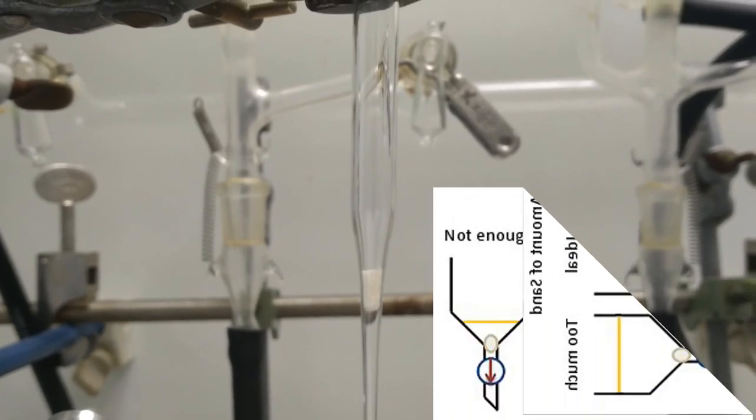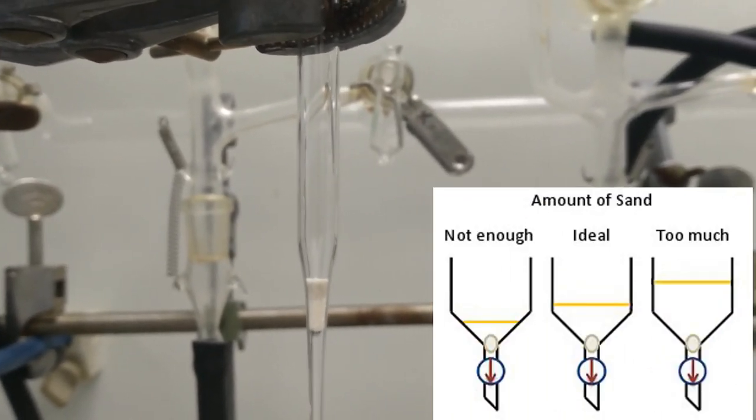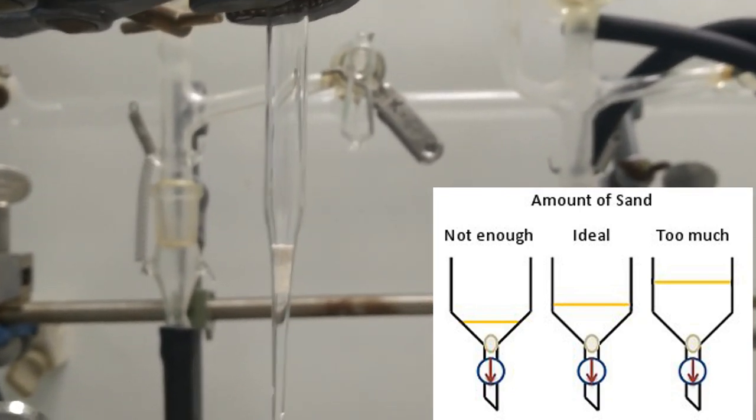After closing the nozzle with cotton, we need to add sand on top of it until a uniform cylindrical surface has been achieved.